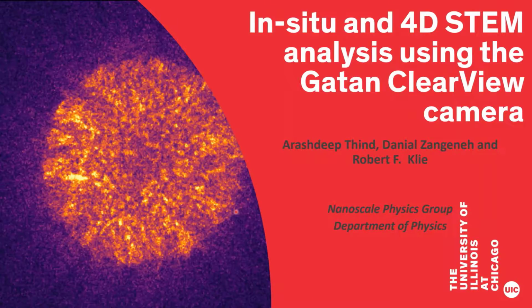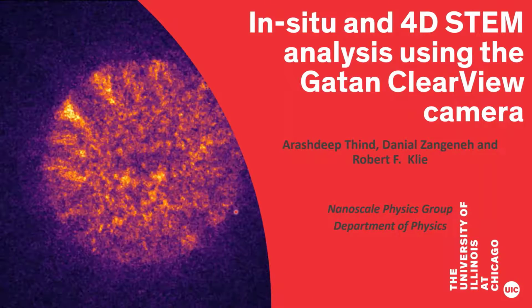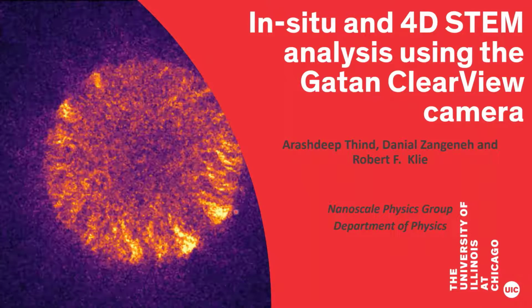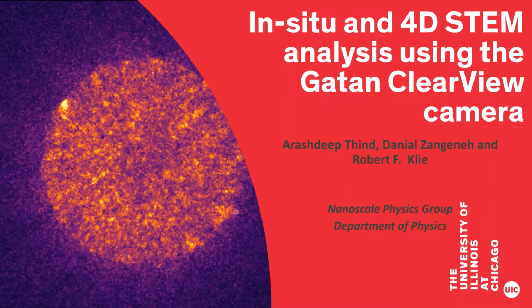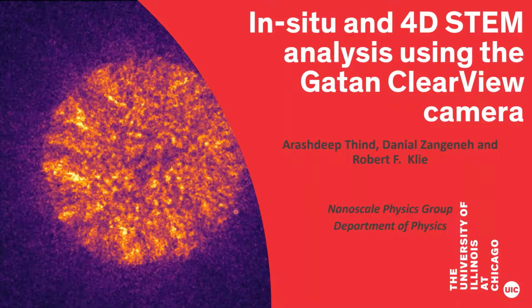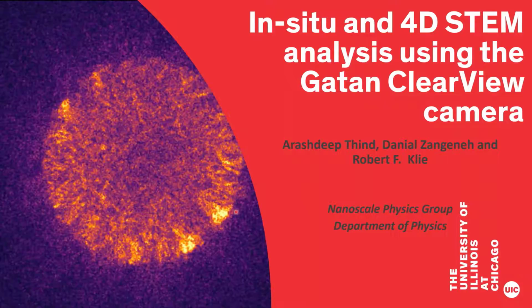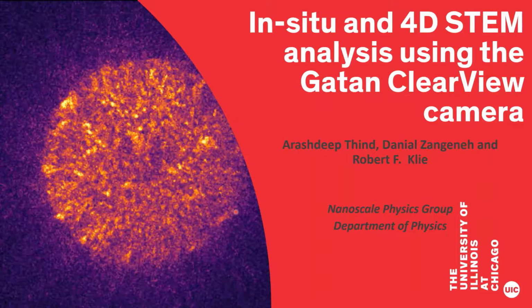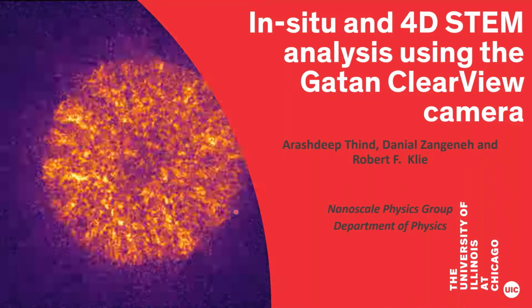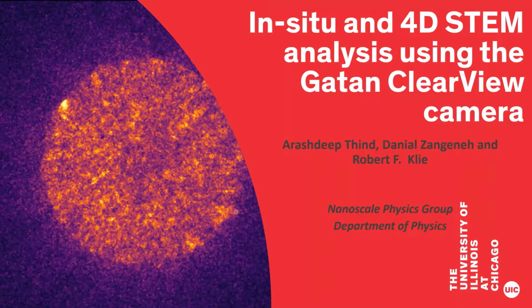Good morning, everybody, and thank you, Fernando, for the great introduction. Thank you all for tuning in. As you heard, what we'll be talking about today is our in situ and 4D STEM analysis using the new Gatan ClearView camera. And the intent of this webinar is to report on our experience with the ClearView camera in this nanoscale physics group here at UIC.